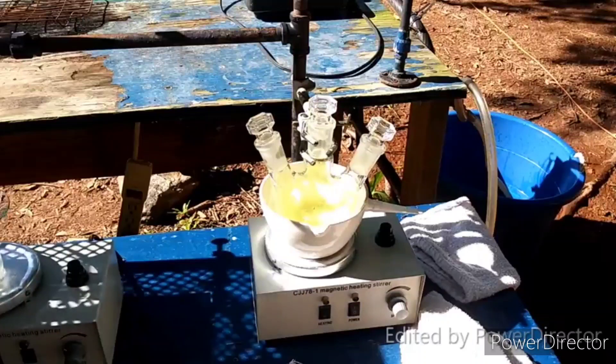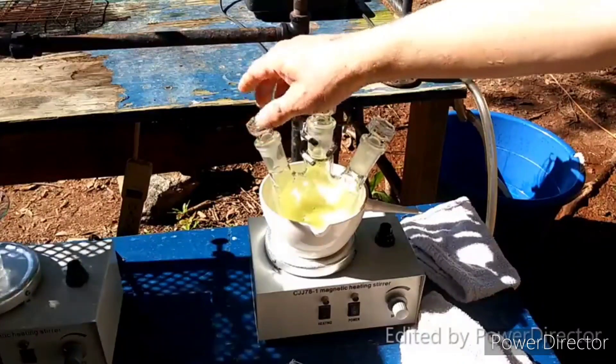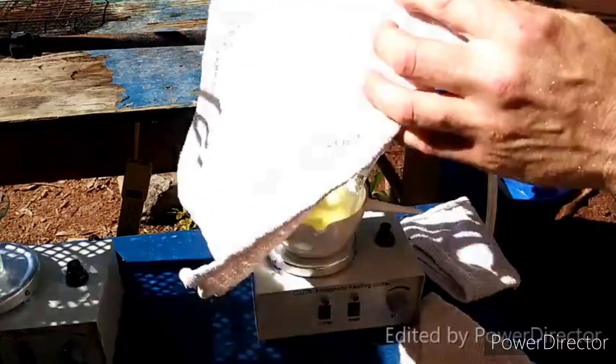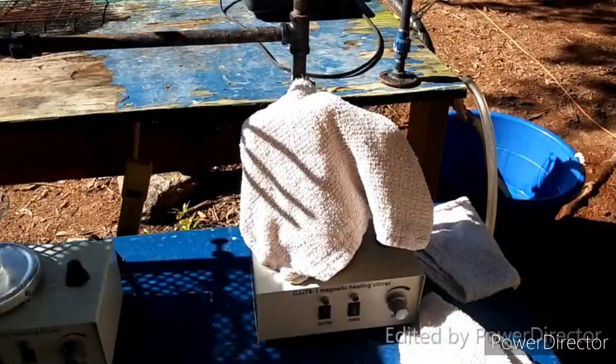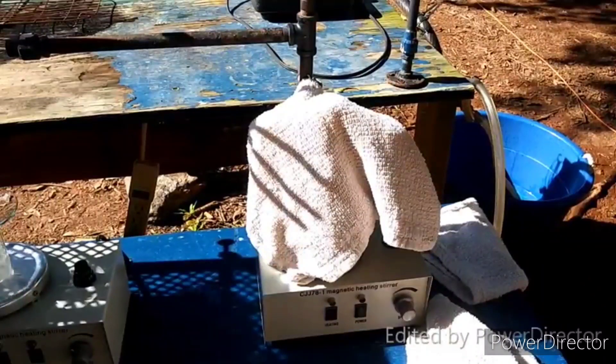Here is our solution of tin tetrachloride in HCl. You can see the solution turned yellow because of the excess chlorine — that's how I knew it was done. I let it keep bubbling for a little while longer just to be sure, and I am trying to keep the sunlight off of it. I don't know that it would hurt it in any way, but just to be safe I'm going to keep it contained.